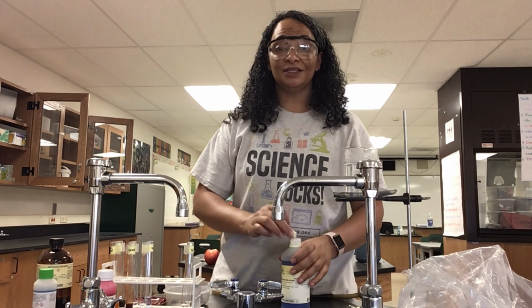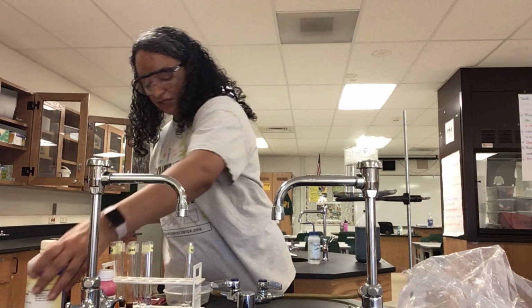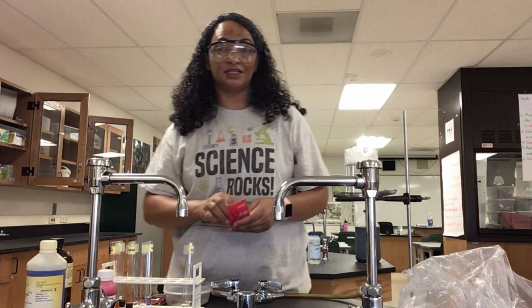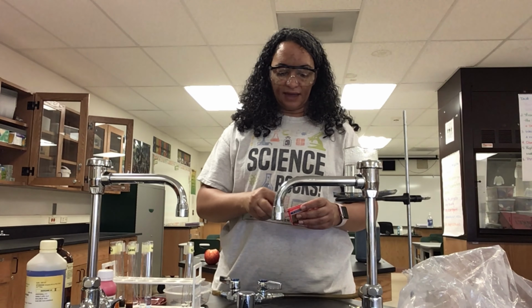All right, so our next two tests require a little bit more. My test for lipids is going to need to sit for a little while, and my test for sugars is going to need to boil for a little while. So I'm going to go ahead and start my gas.